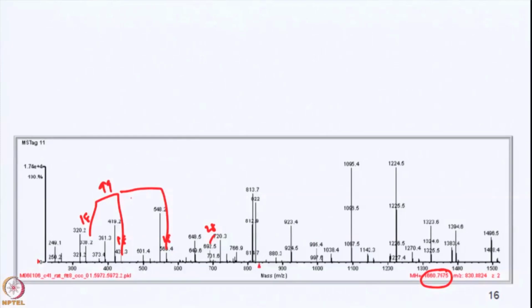All right, that is 99, 37, 53, 129. Do you want 71?